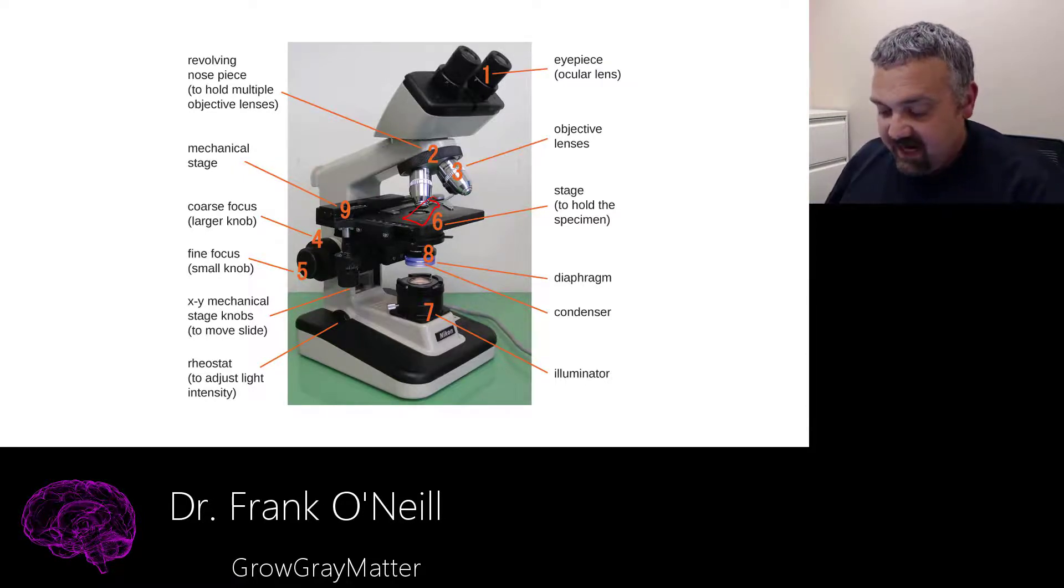Number seven is the illuminator. That's your actual light source. In this instance, being visible light, since it's a light microscope.